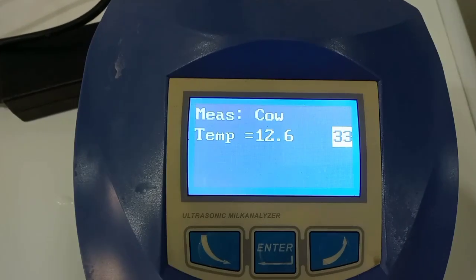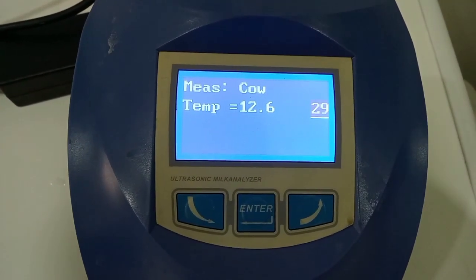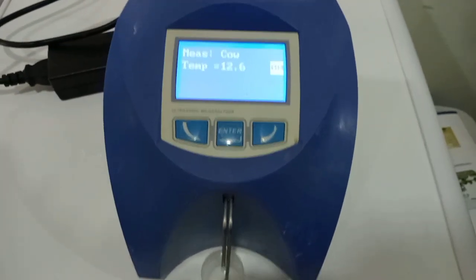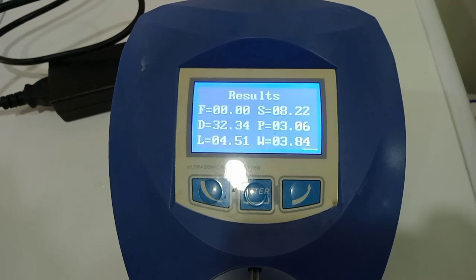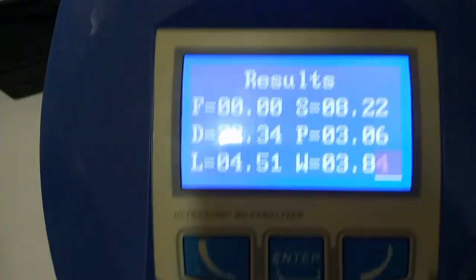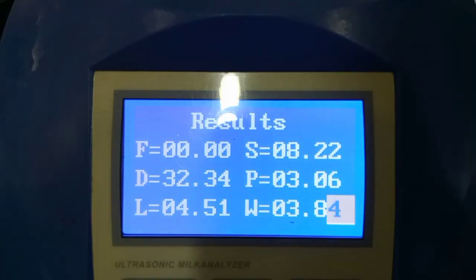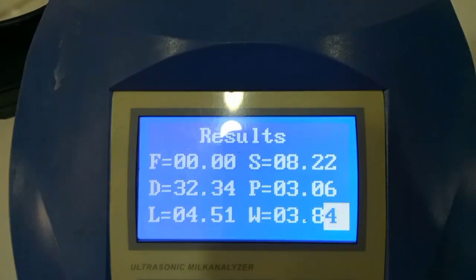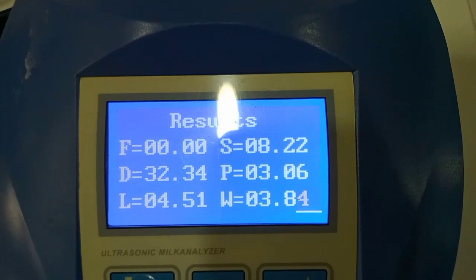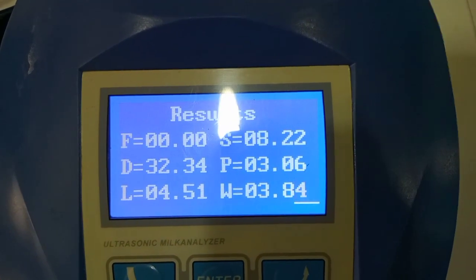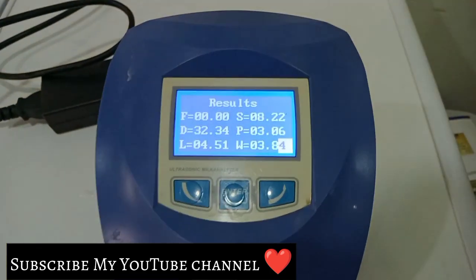We will display the results on screen. The results show: fat 0.00, solids 8.22, density 32.34, protein 3.06, and other analysis values.